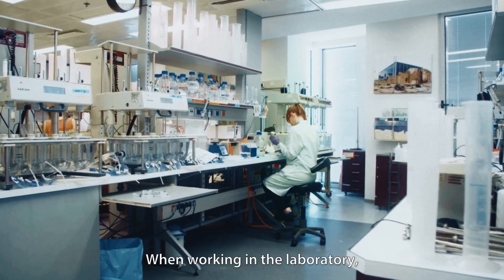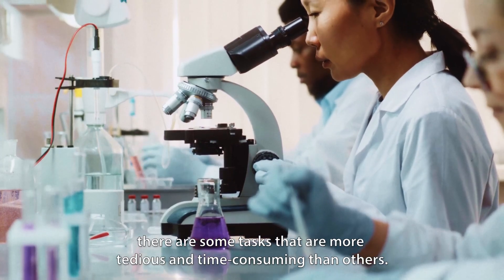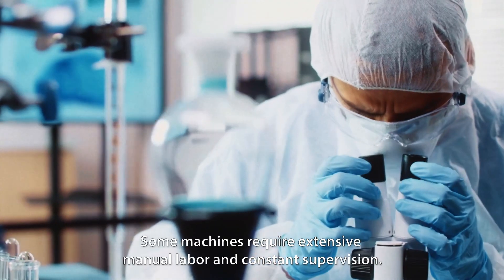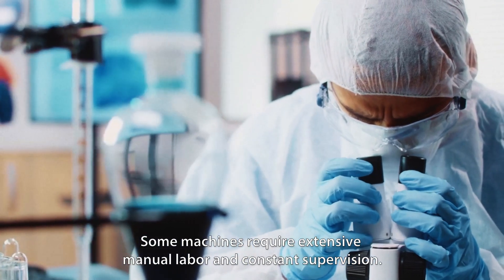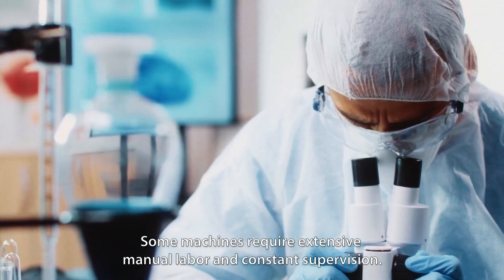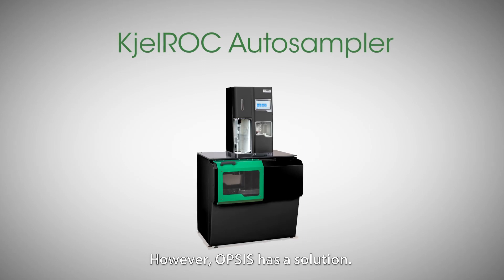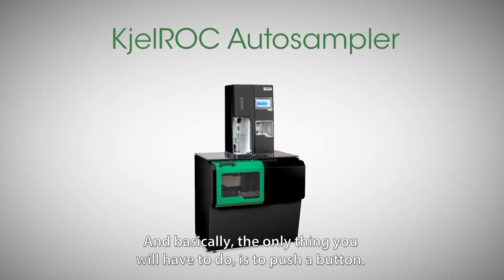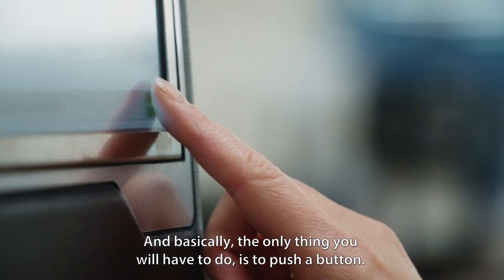When working in the laboratory, there are some tasks that are more tedious and time-consuming than others. Some machines require extensive manual labour and constant supervision. However, OPSIS has a solution, and basically the only thing you will have to do is to push a button.